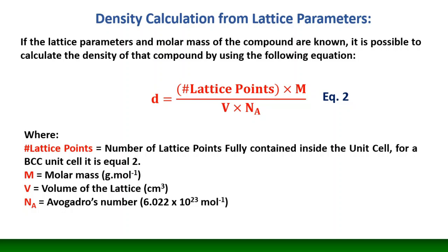So a word of caution before plugging in the value you have here, from my viewpoint: take that lattice parameter that you learned how to calculate previously, and convert it, whether it is in nanometers or angstroms, okay? Convert it first to centimeters, or first to meters and then to centimeters, and once the lattice parameter is in centimeters, then you calculate the volume.